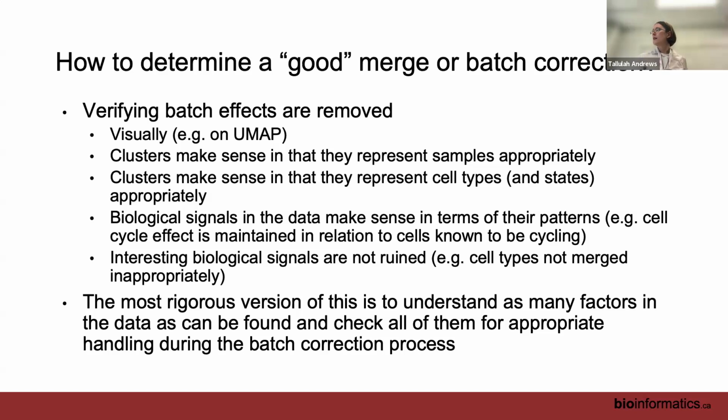And then making sure the interesting biological signals are not ruined. So your different cell types are still distinct. Your cell subtypes you're interested in are still distinct, and they haven't gotten all mixed together from your data integration.